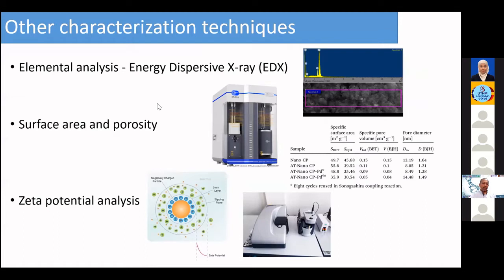And other characterization, EDS, energy dispersive X-ray. Usually this EDS is combined with the FESEM and also TEM. And we can get the elemental information about the elements inside the sample.